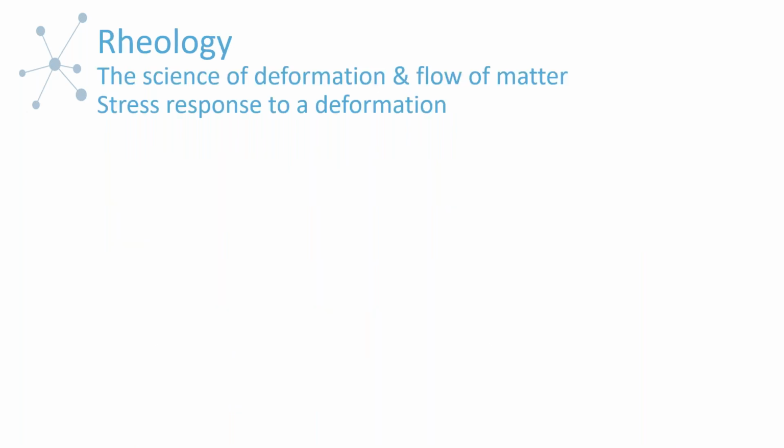Okay, so let's start at the beginning. One of the things we wanted to do is get you to understand this calculation that you need to do to get the viscosity, and then also how we choose or design instrumentation to actually implement this process. A good place to start is always at the beginning. So let's start with rheology in general and what this is.